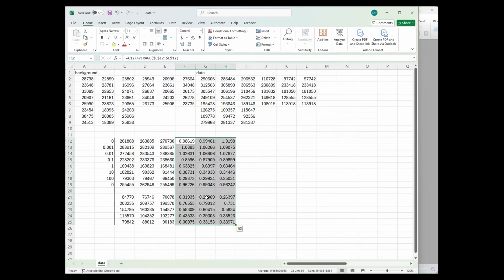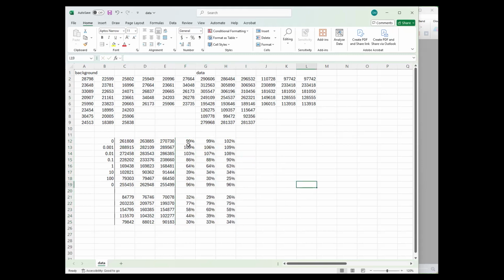And then because we like percentages, I'm going to convert this to percent. All right, so this is what I mean about edge effects. All of these in this group here should be 100% total binding, but as you can see, the RFUs are a little bit lower on the edges here at this set of zeros and this set of zeros. If this happens to you, there's a couple of things you can do. You can take the red block and average across. I probably wouldn't do 0.01, but you can average across the 0.001 and that'll even up your percentages a bit more.